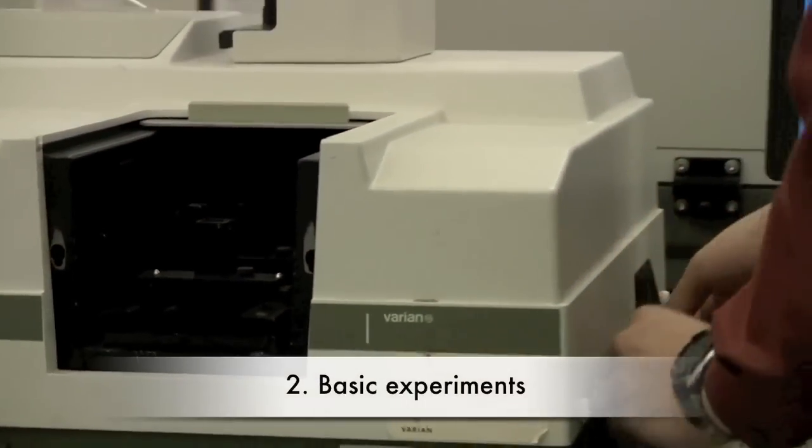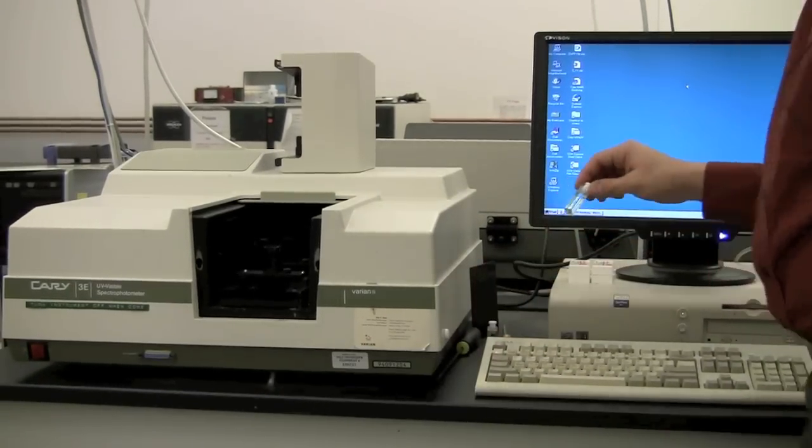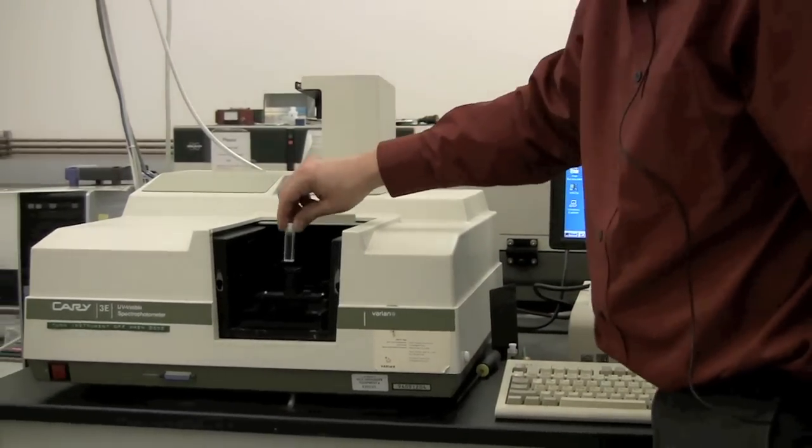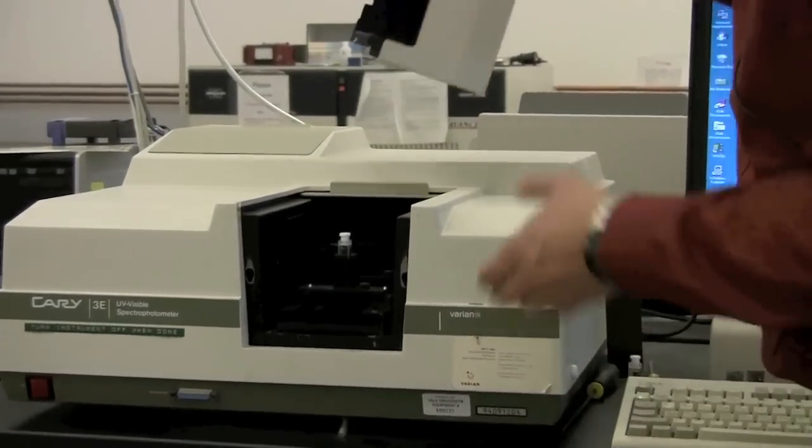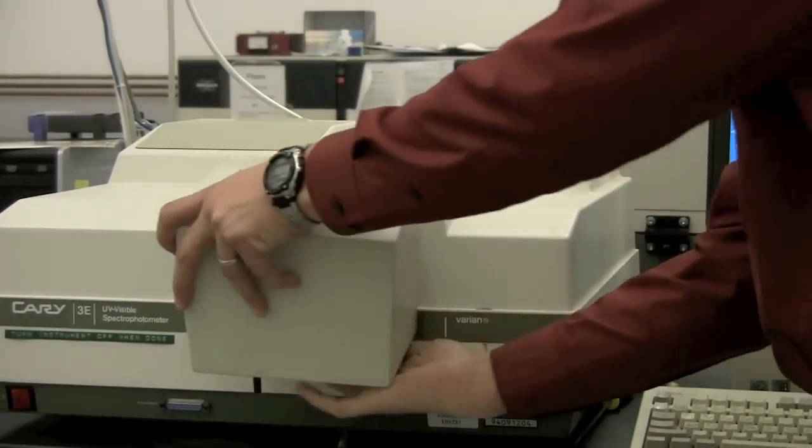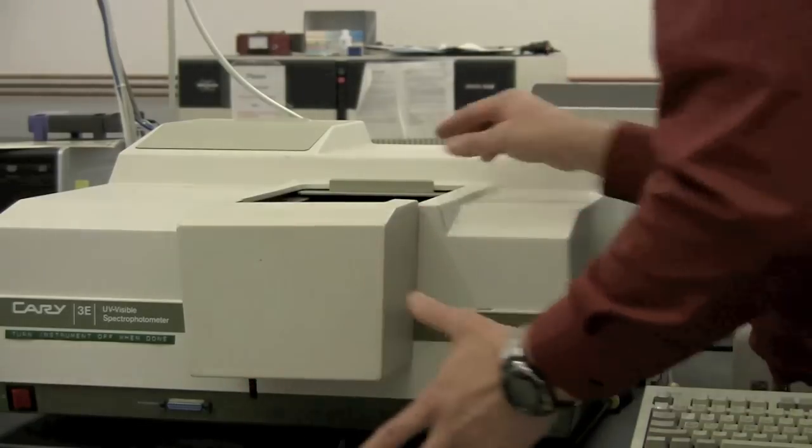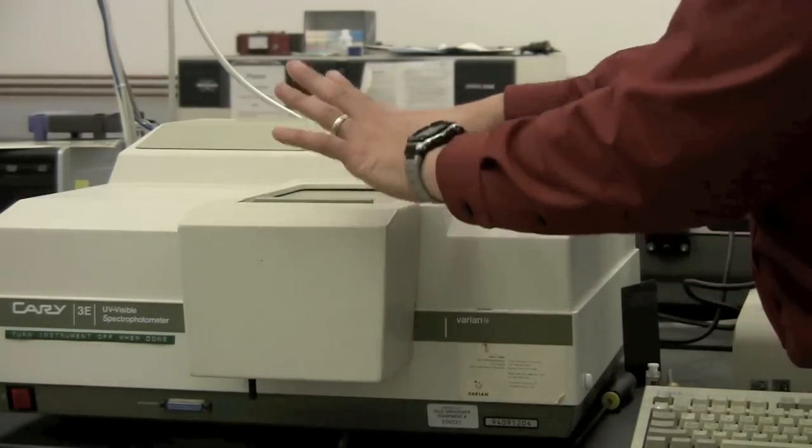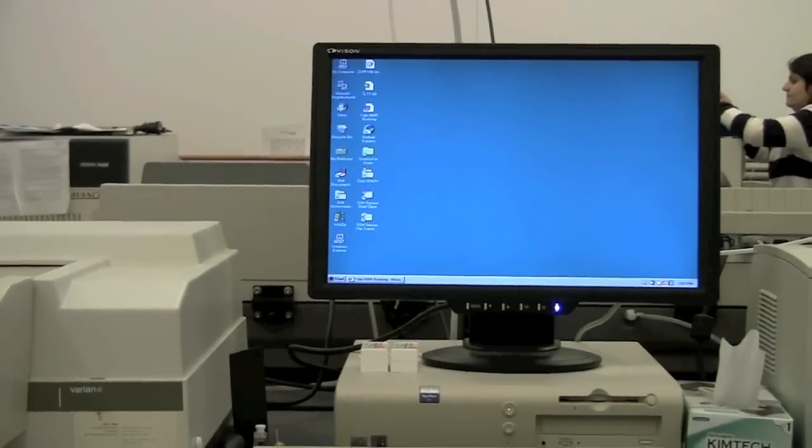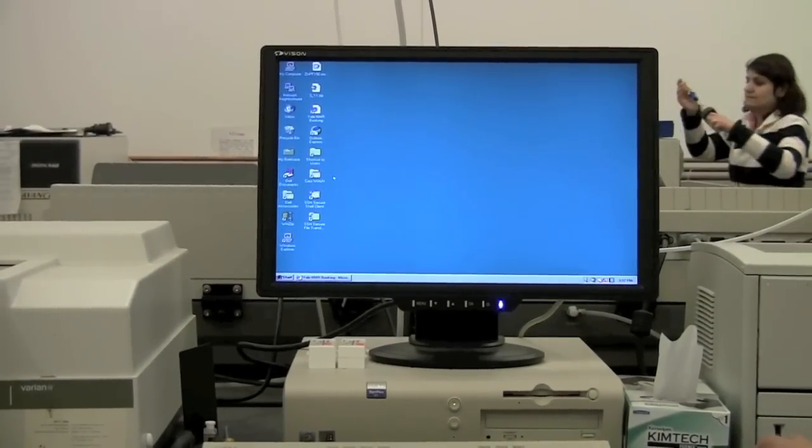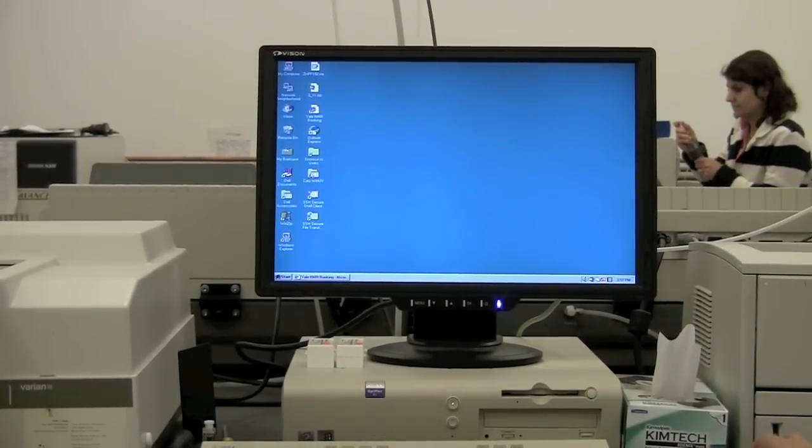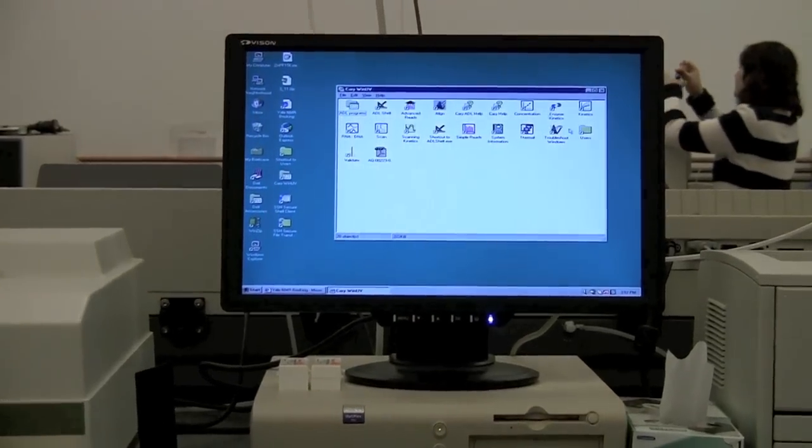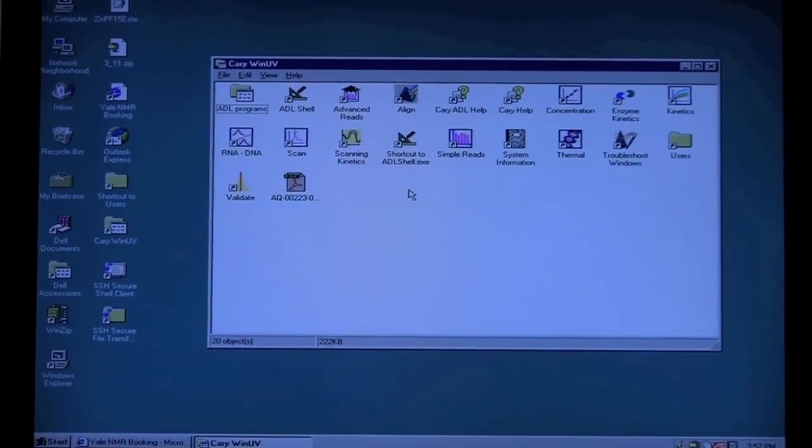Okay, so there are a variety of experiments you can do. I'm just going to show you a couple of the most basic ones. So I'm going to put a single sample in, single beam mode, and put the front back on. Make sure that everything is set so it blocks out all of the light. Now the software, all of the different modes are separate programs, and they're all located here in this Carry WinUV folder. So you can double click on the folder to open up the different programs here. The most common programs are Simple Reads.